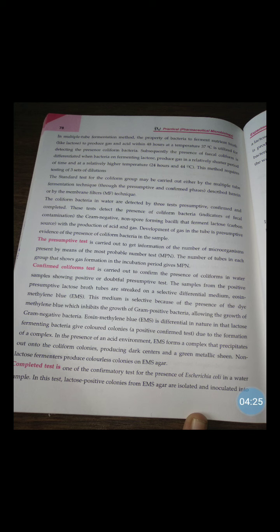Subsequently, the presence of fecal coliform is differentiated when the bacteria, on fermenting lactose, produce gas in a relatively shorter period of time and at a relatively higher temperature, that is 44 degrees Celsius. This method requires testing of 3 sets of dilutions.